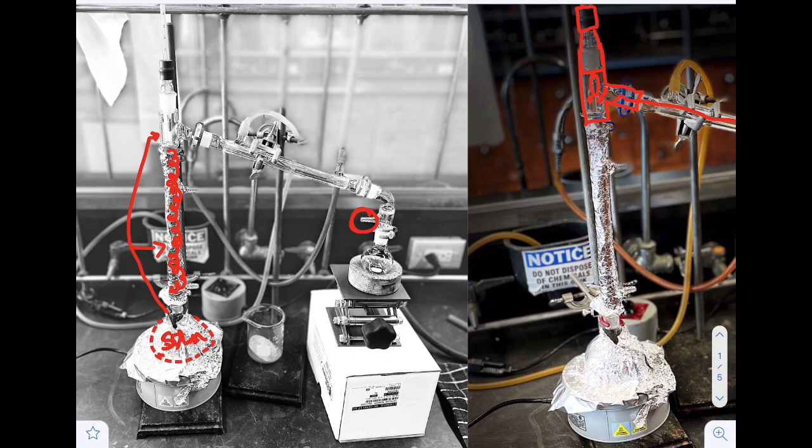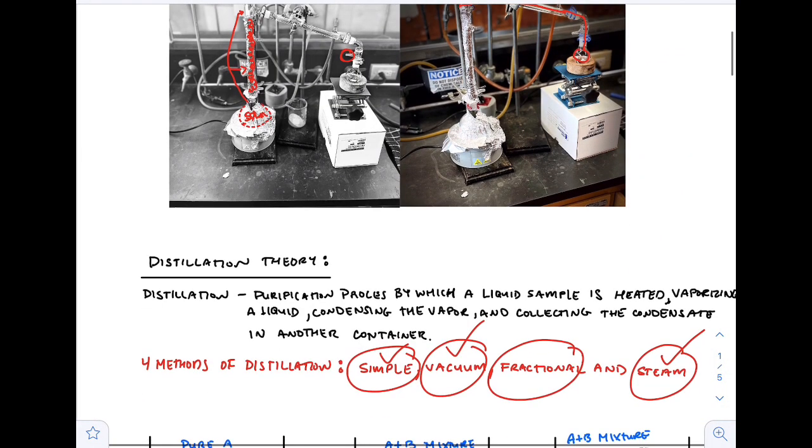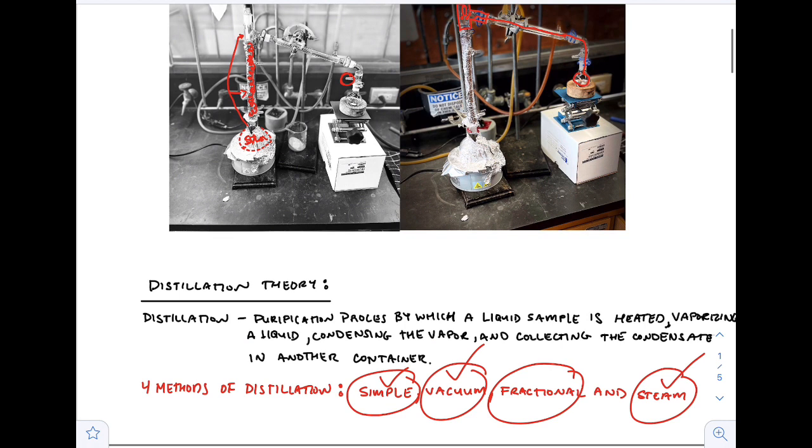And what that does is it decreases the pressure within the whole system. So if you have a liquid that has a boiling point of like 200 degrees, then we know that if you decrease the pressure within that system, then the boiling point of that liquid will also go down. And so it's actually a lot easier to distill that liquid now. Okay, so that would be one of the benefits of a vacuum distillation. Super fun, but they're also kind of dangerous sometimes if you're not careful, because if you do something silly, the vacuum within here could just kind of suck things out, or if you do a vacuum distillation and you shouldn't because your liquid is not a high boiling point liquid.